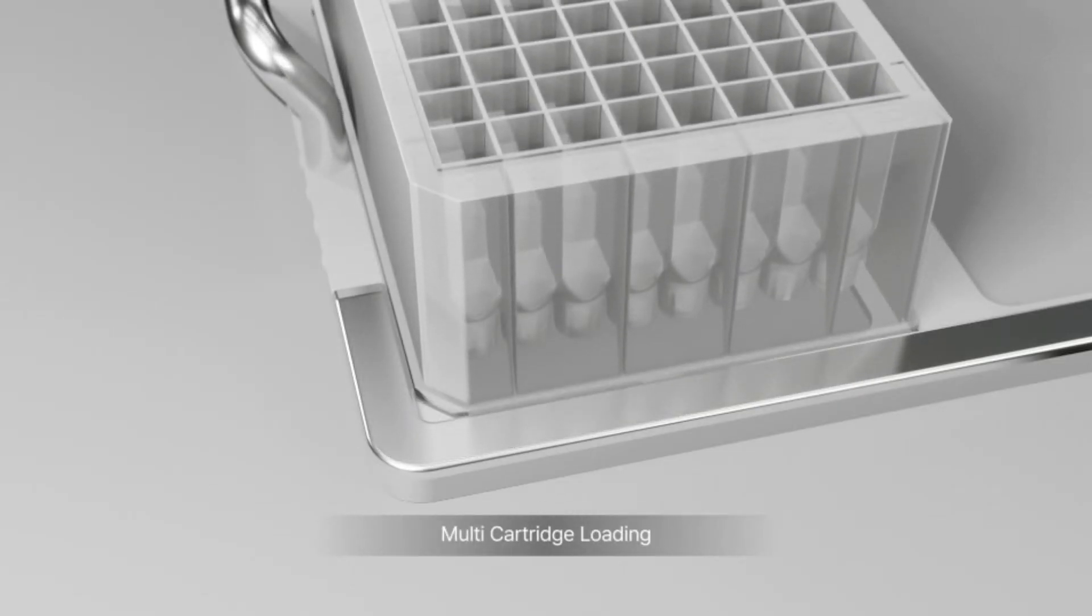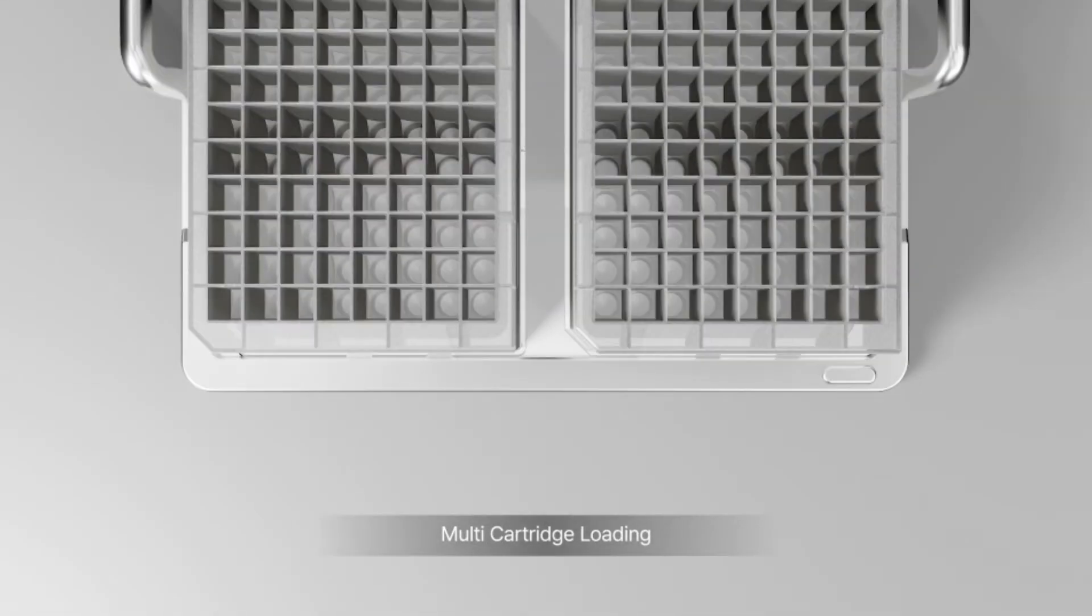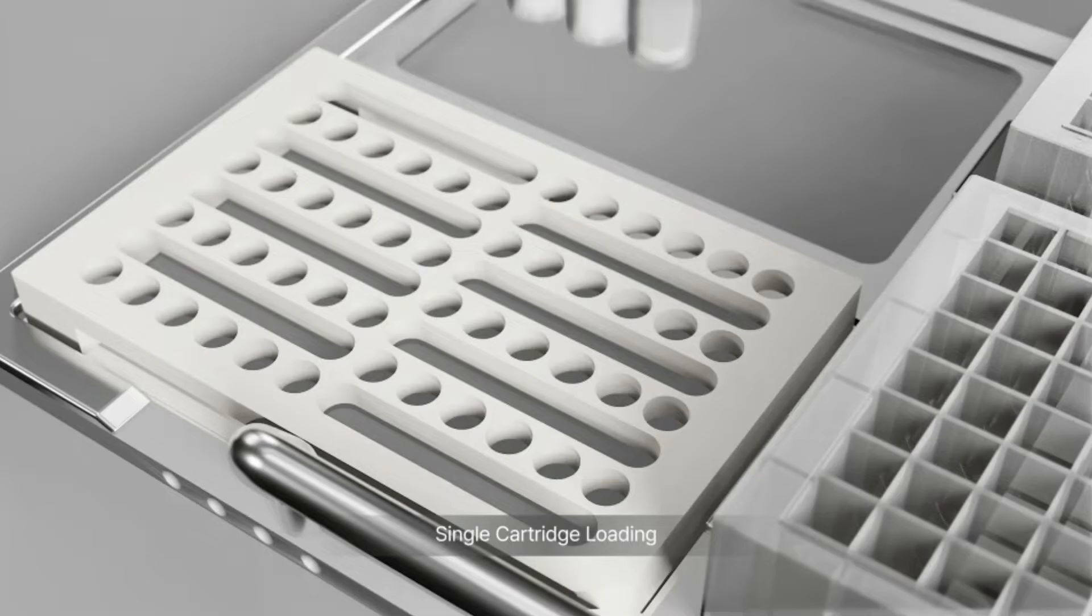Users can choose from pre-filled reagent plates and flexible eight-well strips for processing samples in groups or individually at a time.